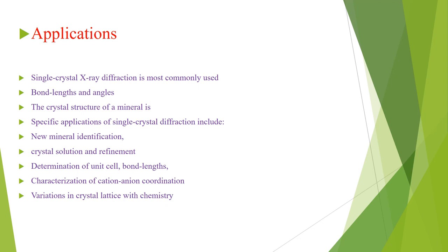And the characterization of the cation and anion coordination is also one of the applications of single crystal X-ray diffraction. And the variation in crystal lattice with chemistry is also studied by using SCXRD, the single crystal X-ray diffraction technique.